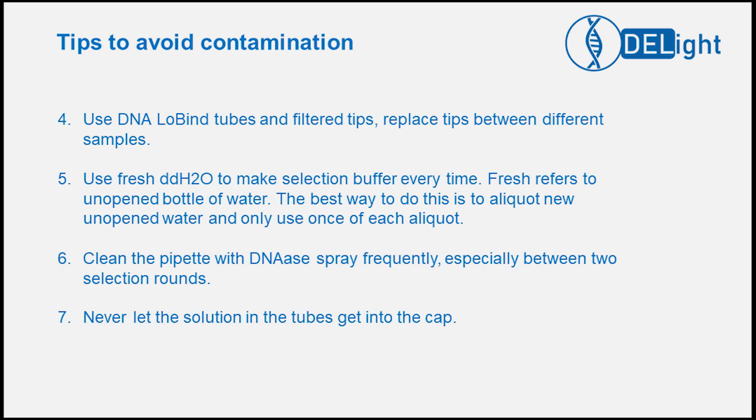Use fresh deionized water consistently throughout the entire selection process. Fresh water refers to water from a never-once-opened water container after collecting from the ultra filter. Therefore, the best way is to aliquot new unopened water and only use each aliquot one time. Clean the pipette with DNase spray frequently, especially between two selection rounds. Never let the solution in the tubes get in contact with the cap. If you see a droplet in the cap, pipette it back to the main sample volume and then transfer to a brand new tube.